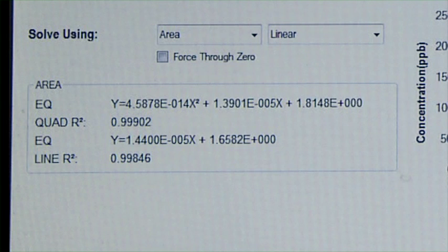The correlation of fit for a linear equation should be at least .995 for best quantitative results. A quadratic fit option is also available in Elvin.